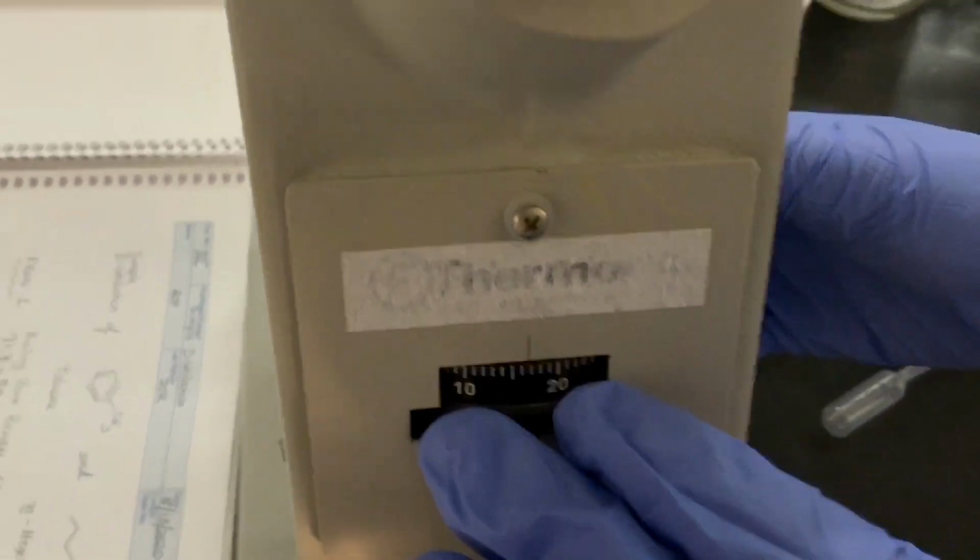So there we go. And there's another fine tuner that is in the front that sort of helps, so that's this one here, let me grab it, that is going to help sharpen that line. So we're back in there.